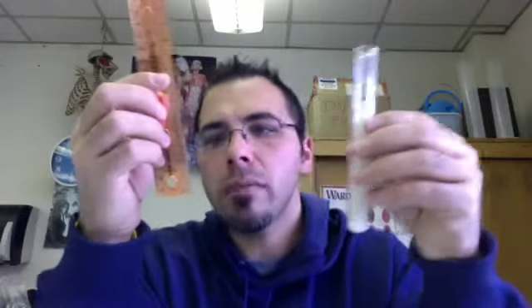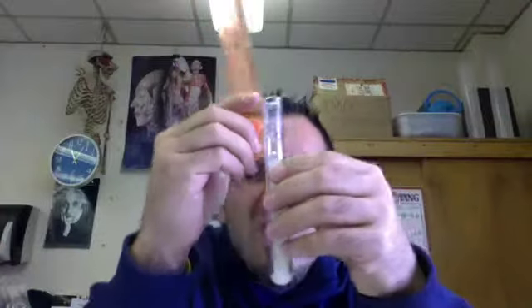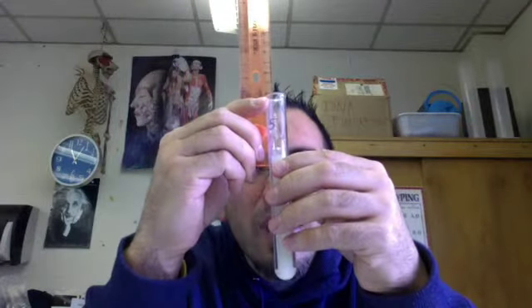Then we're through number 8, small air bubble, 9. Repeat 4 through 6. With a small plastic ruler, measure the height of airspace on the bottom of each of the small test tubes. That might be kind of tough to do. That's why I said mark it. Let's see. I should probably use the right side. I'm going to say that's about 0.9 centimeter, or if you want to go to millimeters, I don't care.